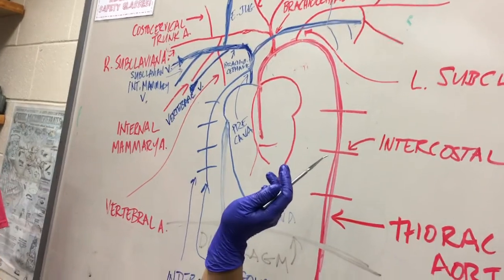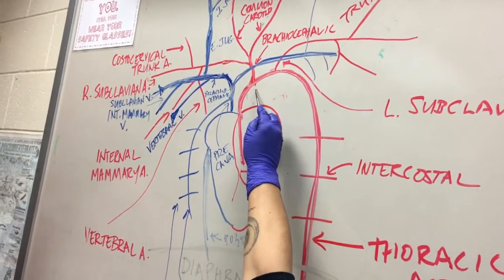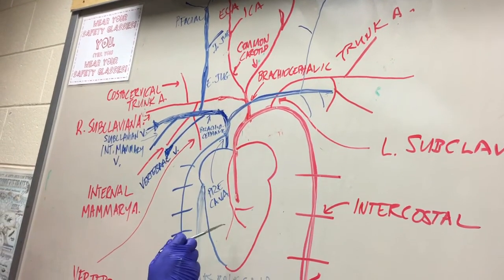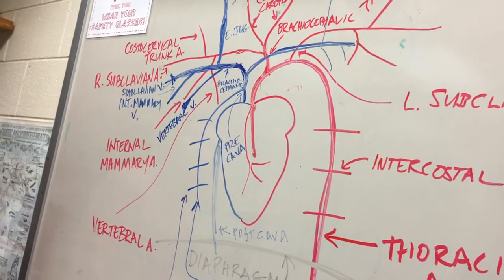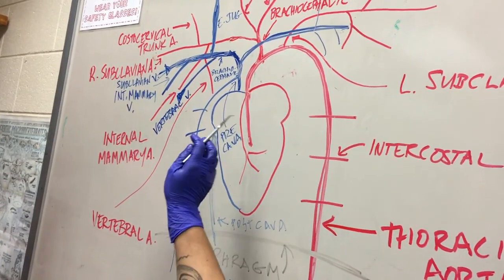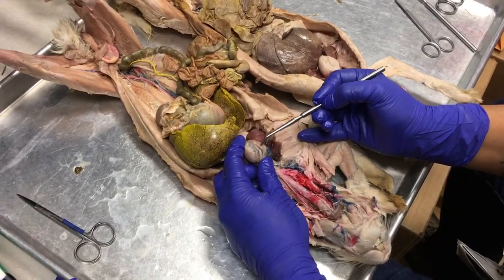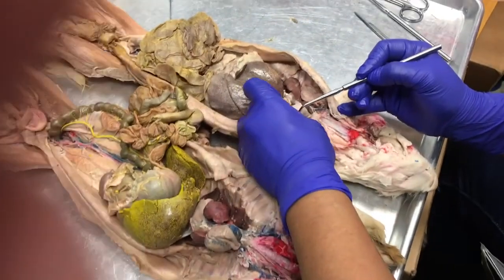of the aorta. Okay, so what we find is that there are two visible branches from the arch of the aorta. There's one branch that we can't really see that serves all of the coronary arteries on the heart. And because we can't see that branch, we identify the coronary arteries on the surface of the heart. So this one here, you can see some pink.